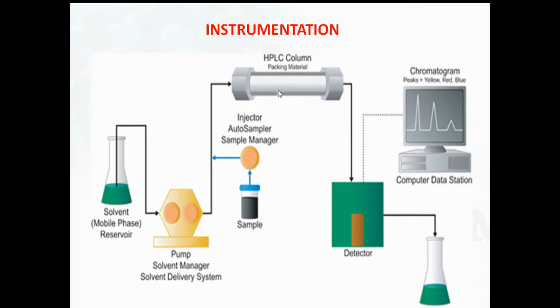High pressure is applied in this technique. So we need a pump, which acts as the solvent delivery system. What this pump will do is, by applying high pressure, help the solvent get into the column. Before the solvent enters the column, there is a sample injector.